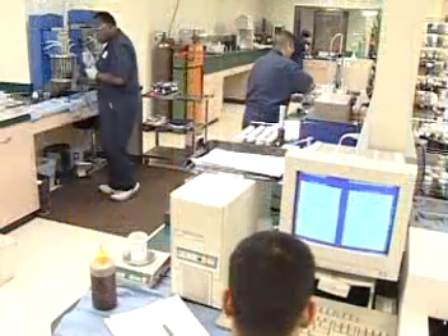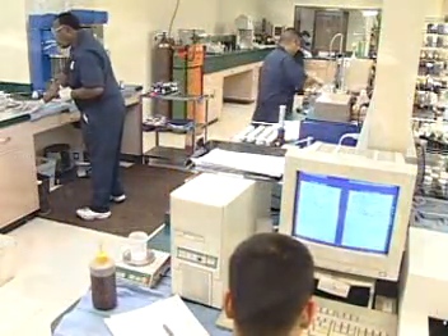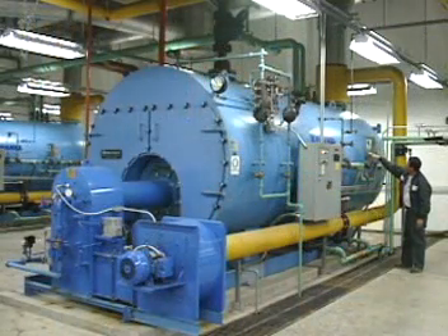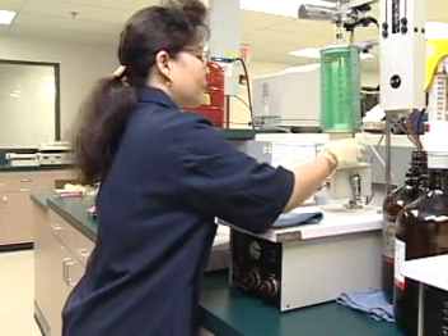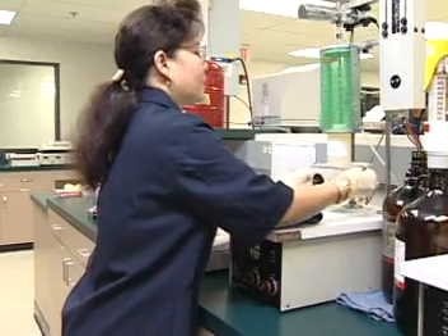The laboratory performs a number of chemical and physical tests determined by the type of equipment, its application, and your company's program objectives. If sample analysis indicates a critical problem with your equipment, our analyst will immediately call and discuss it with you, making recommendations and referring to detailed information that will appear in the laboratory report.